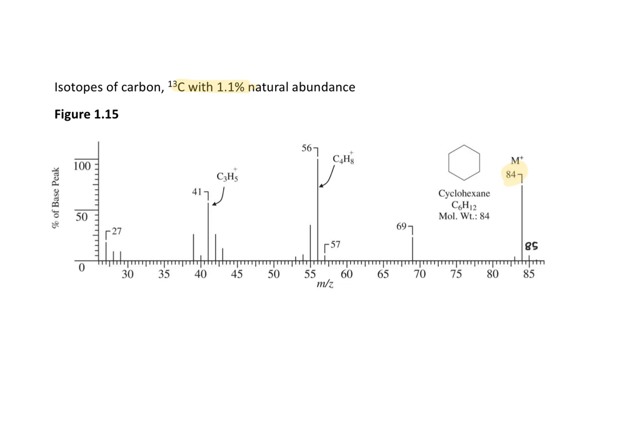And for a 6-carbon compound, note that the amplitude of the peak at 85 is about 6.6% of the amplitude of the peak at mass over charge of 84. I recommend looking for this in order to confirm a molecular formula.